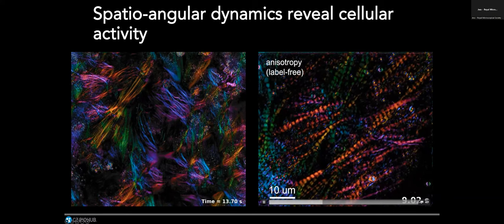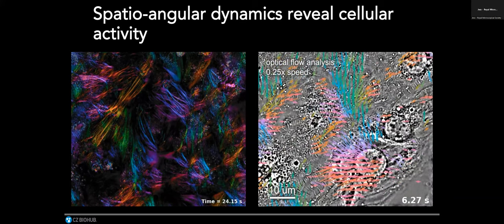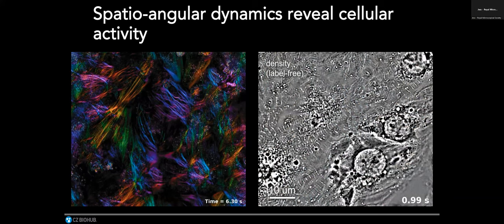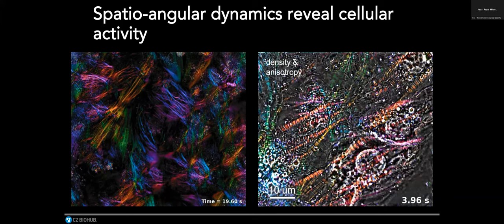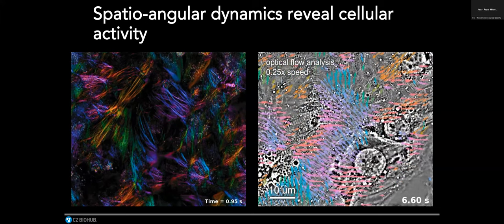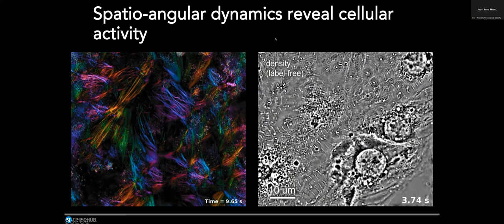And we have found that these readouts of the density and of the Z disk and A band can be more consistent, can be more reproducible, because if you try to do antibody labeling, you are going to incur some stochasticity due to labeling. So in cases where these measurements work, where the questions are really about visualizing architecture and activity, and the structure of interest is visible beyond background, these readouts can be quite valuable, and one can do optical flow analysis and understand really the contractile activity of cells from this data.